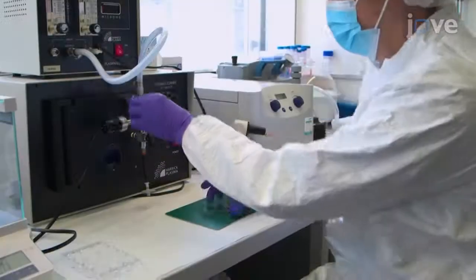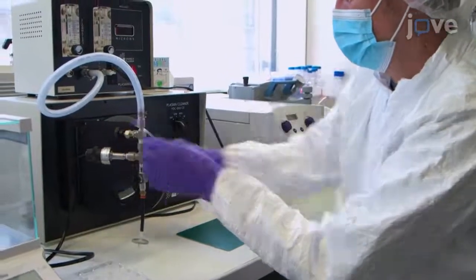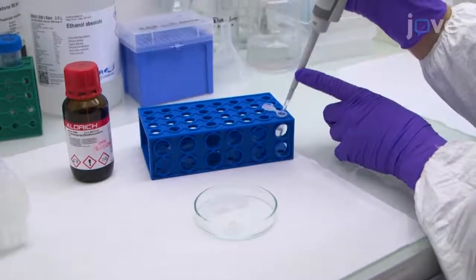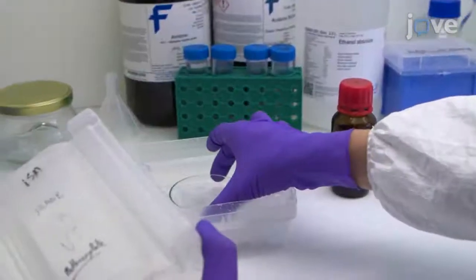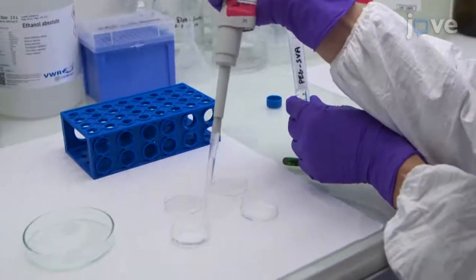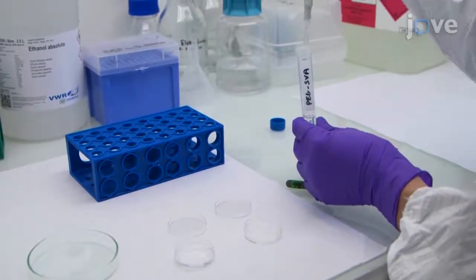To make a substrate for the micropatterning, treat 18 mm circular glass coverslips by air or plasma activation for 5 minutes, before placing the coverslips in a desiccator with 100 µl of 3-aminopropyl triethoxysilane for 1 hour. Then incubate a solution of PEG-SVA at 100 mg per milliliter for 1 hour.